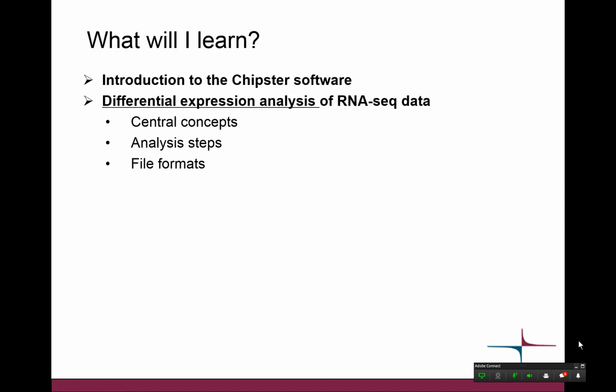Yeah, indeed we are keeping the topic very brief, and we are focusing on the main steps of differential expression analysis of RNA-seq data. Usually our courses on this particular topic are 1 to 2 days, so this is going to be a short introduction kind of presentation.